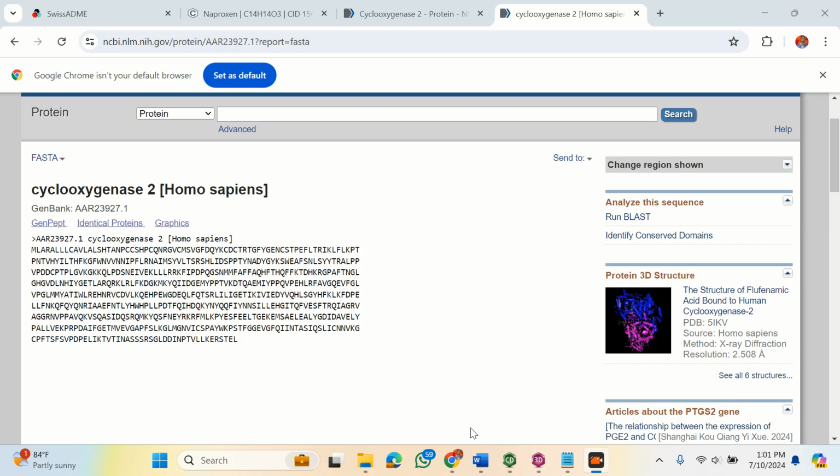UniProt is another server. I think I mentioned that yesterday. You can use PDB to access your proteins or UniProt. If you accessed it from UniProt, you might have an accession number assigned to that sequence. So here we have our sequence.